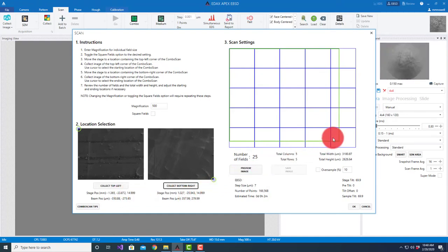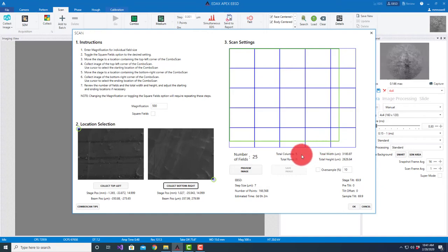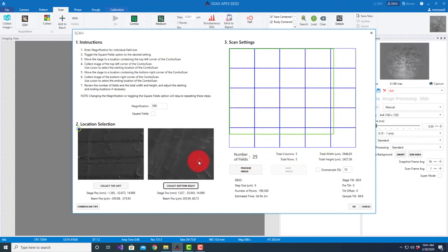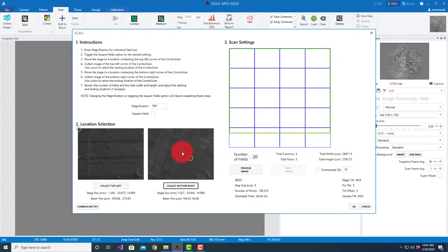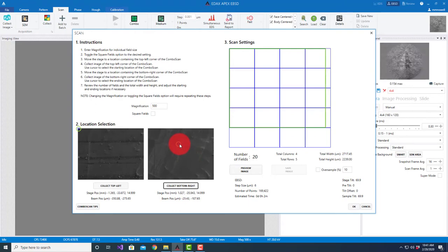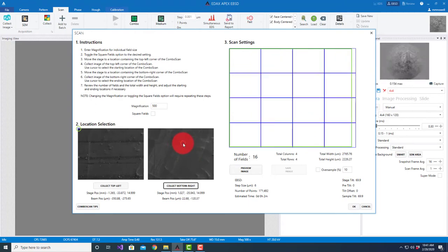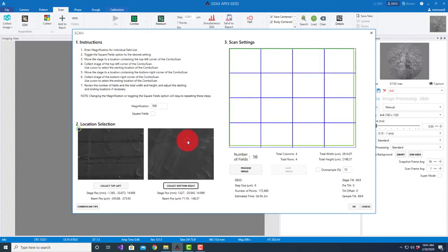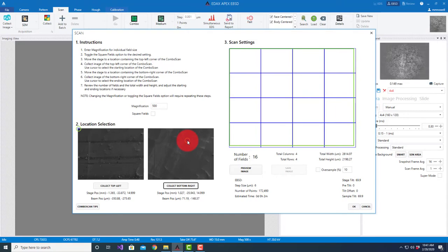We get an idea of the number of fields. Right now it's looking at a 5x5 field of view based on where I've selected. You can see if I start positioning this I can get to 4x4. If I want to look at 4x4 fields I could do something like that. That's probably a good approximation.